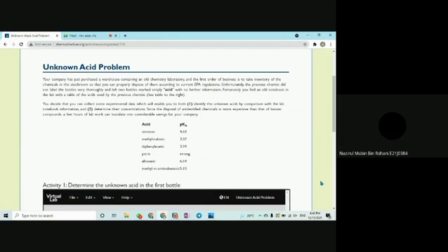When solving a titration problem with an acid and a base, there are certain values that we want to attain, including the initial pH and the final pH. In these experiments, we'll mix the phenolphthalein and the unknown acid. And that's all for the introduction.